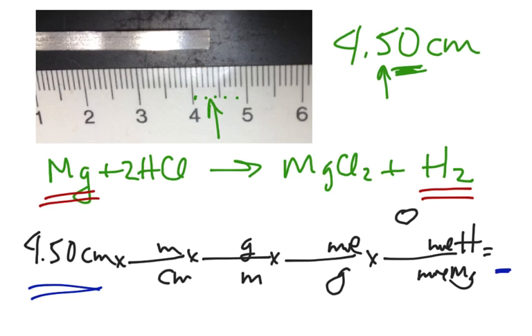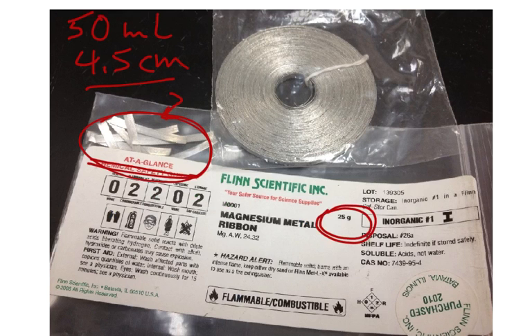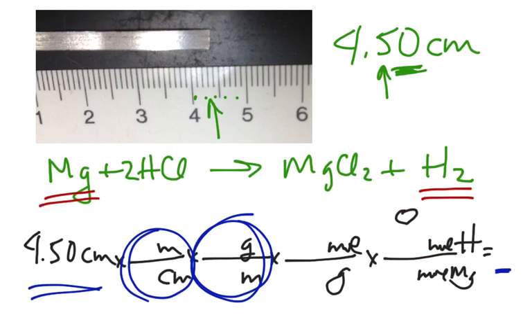So this one here, that's just metric. There's 100 centimeters in a meter. This one is important because that's going to have to be based on going back and measuring 1 meter of this ribbon and finding out how much it weighs. So that'll be done on the day of the lab.